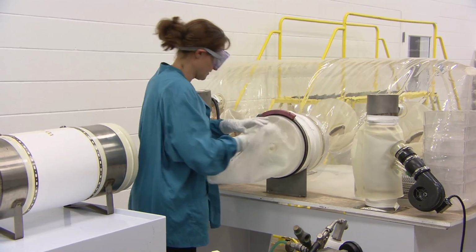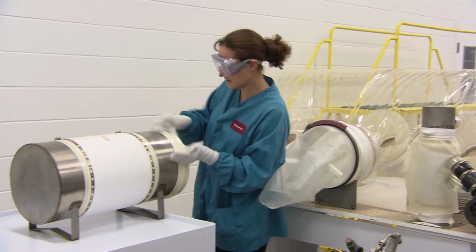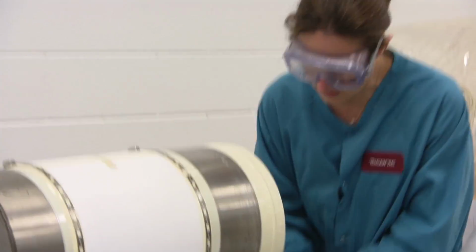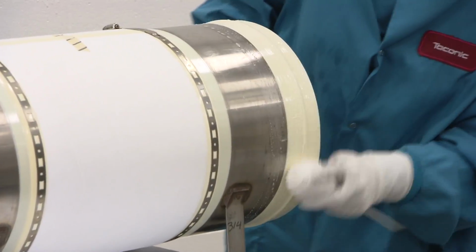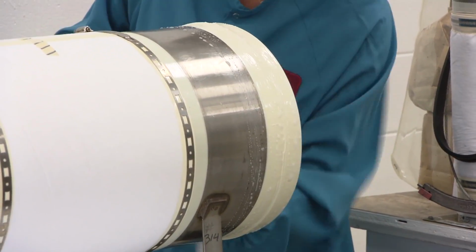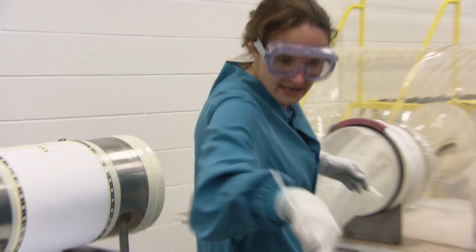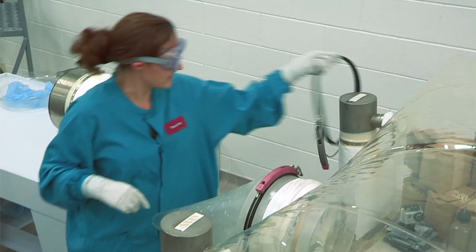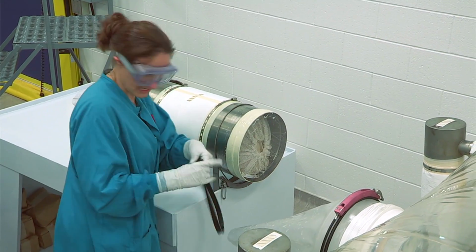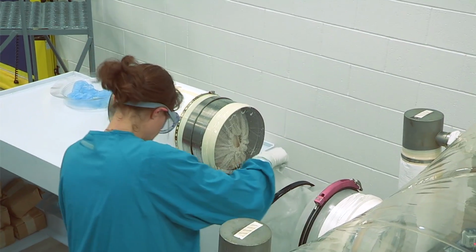And then we can swab our cylinder. And like to come out onto the cylinder beyond the tape about 1 inch and go all the way around, and then do the face of our cylinder. And now we use another clamp and band to attach the sleeve to the cylinder. And again, the 2-inch tape can be used, but this is just a lot quicker.